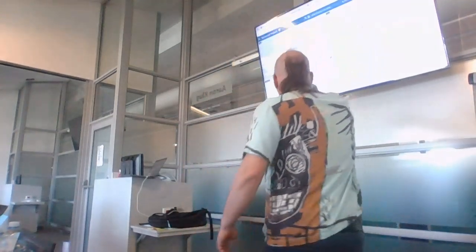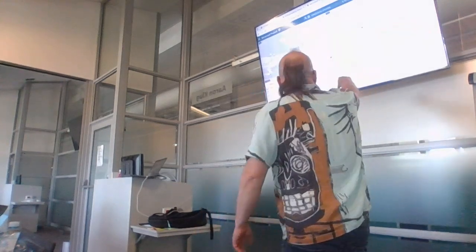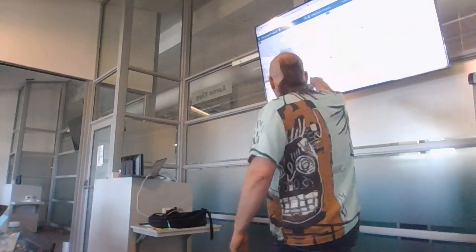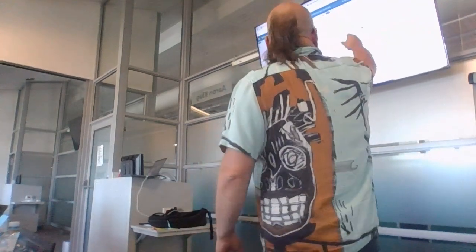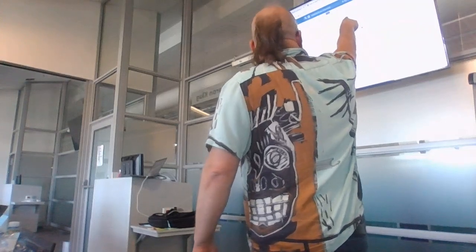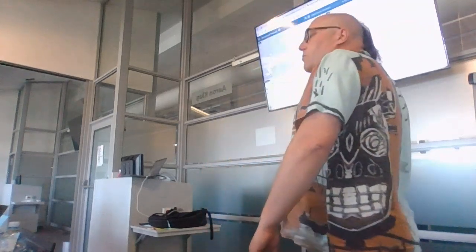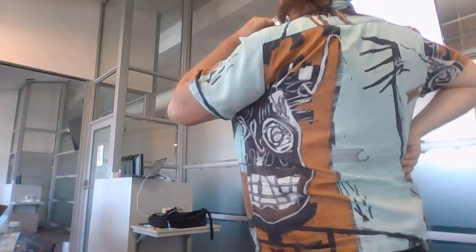If we look at this, okay, here's the metadata on date. So if we look at 253, right? The 253 that we were discussing earlier, right? 253 is over there at the top, just below the reference, okay? And remember that 253 was quite similar to 373.